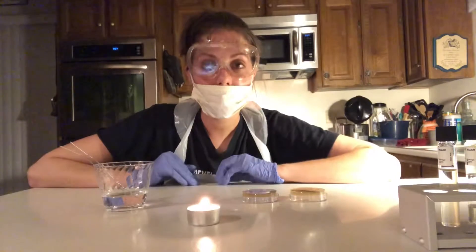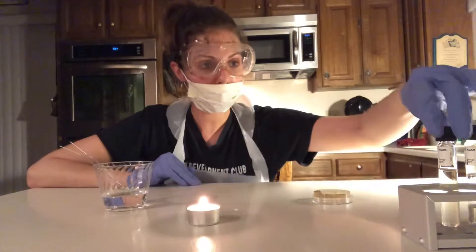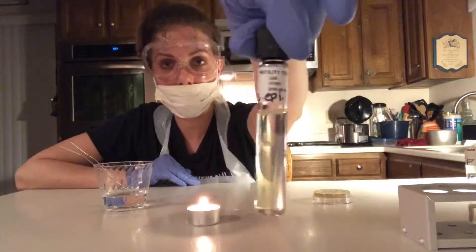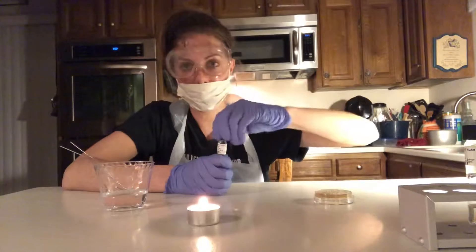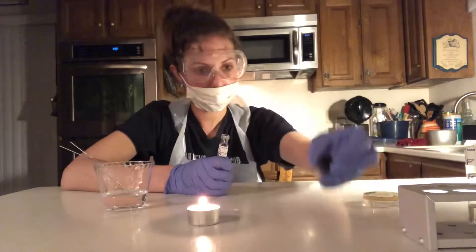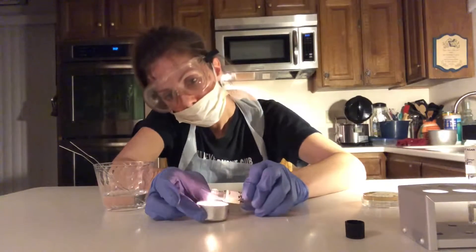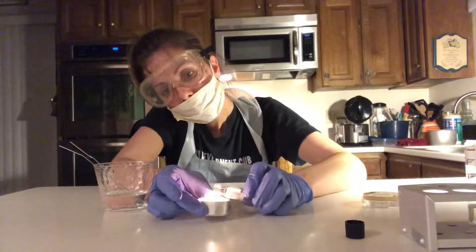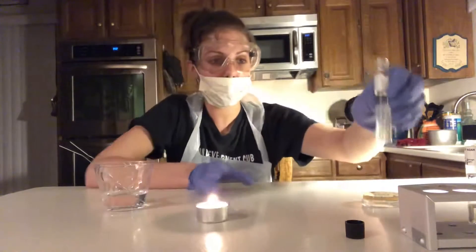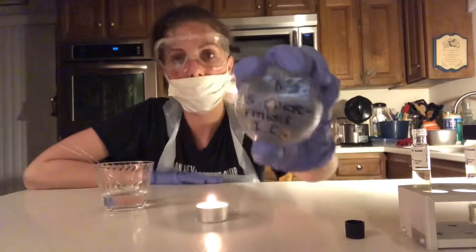So I'm going to prep the S. epidermidis motility test tube first. I'm going to put the E. coli aside and start by taking the S. epidermidis motility test tube and sterilize the lip of the tube using this flame. I'm going to unscrew the cap and sterilize it. Then I'll put this back just for a moment for safe keeping and take the S. epidermidis agar plate.